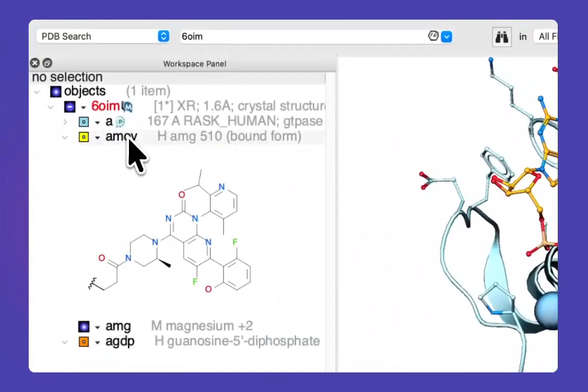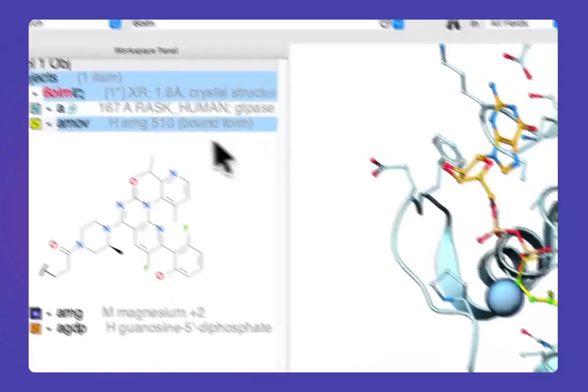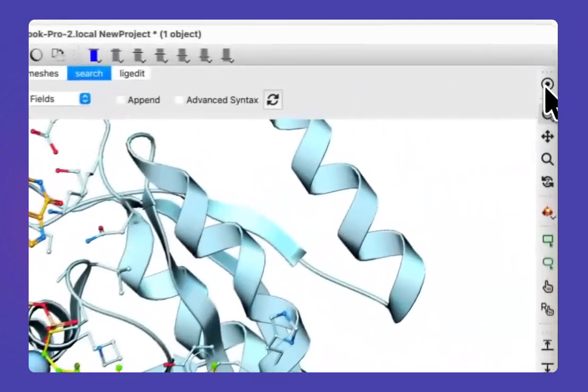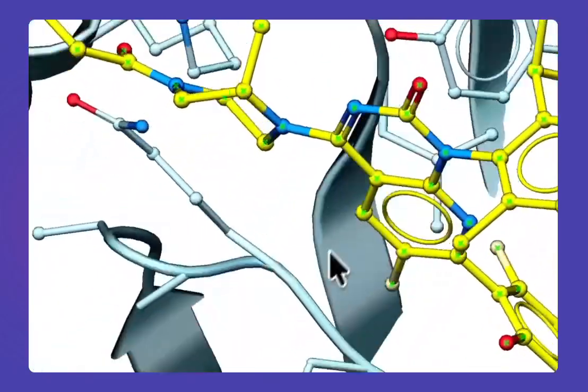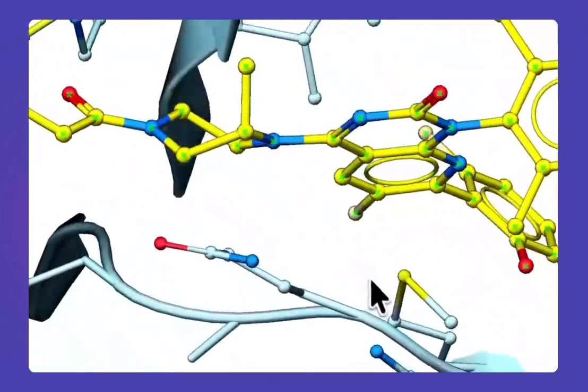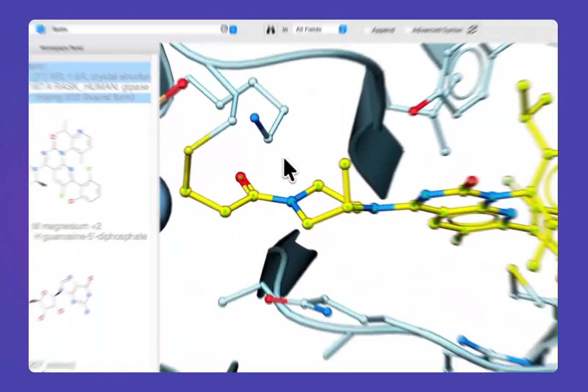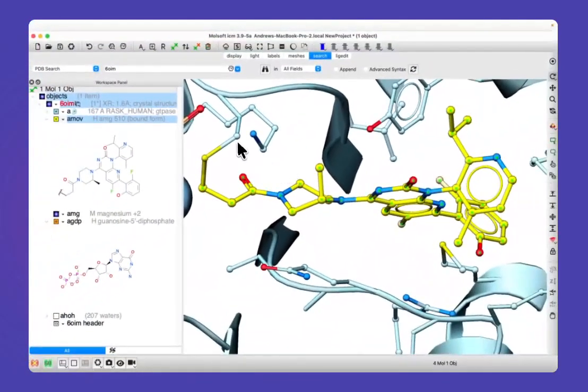Here we can zoom in. If we make a selection, we can just double click here, and you see it's selected blue and yellow, green crosses here on the drug. And we can zoom in and we display Sotorasib. It's a covalent inhibitor which directly targets the mutation. The mutation is this glycine to cysteine.